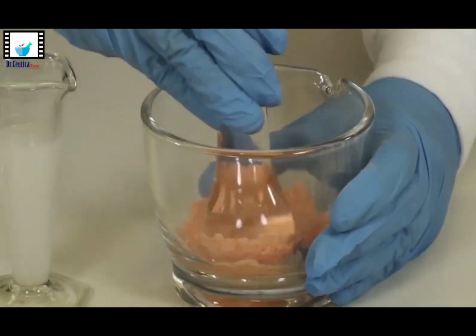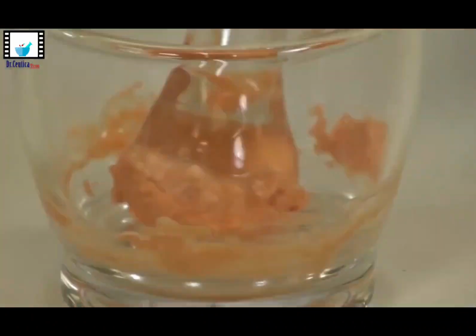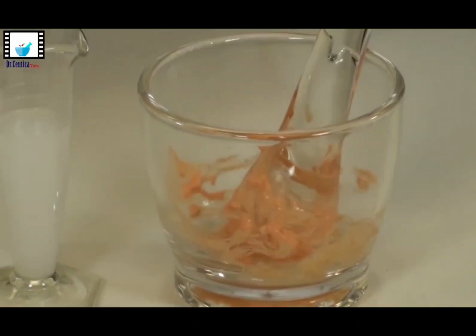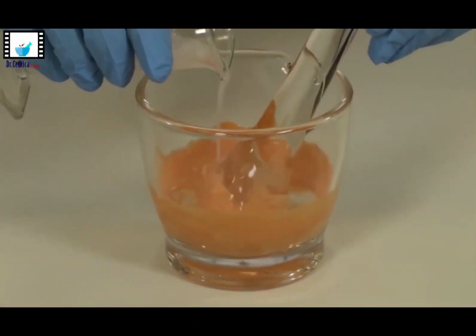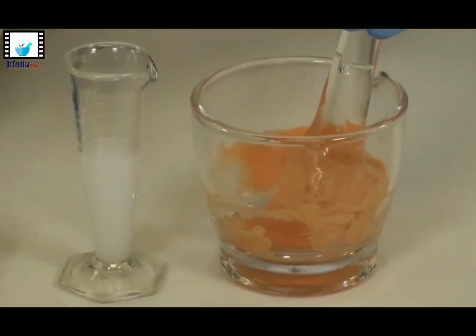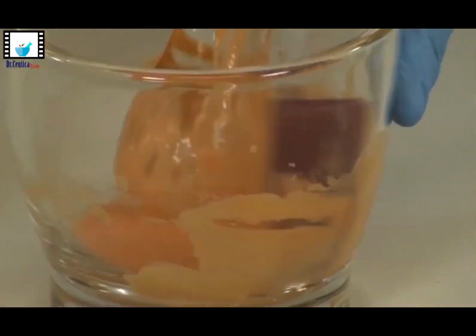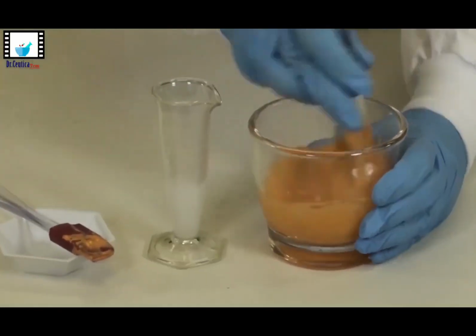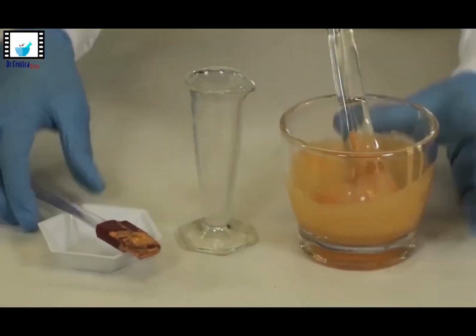Don't press too hard or else you will get some clumps there. Use the rubber spatula to scrape the drug from the pestle every once in a while and also from the sides of the mortar. Continue adding these small amounts of the suspending agent till you get a smooth slurry. Then you can start adding the remainder of the suspending agent geometrically till it finishes.